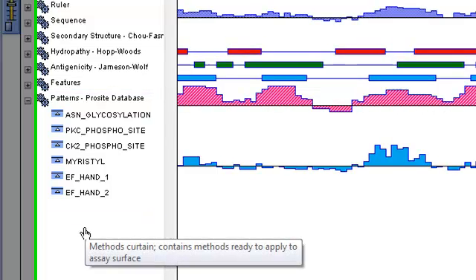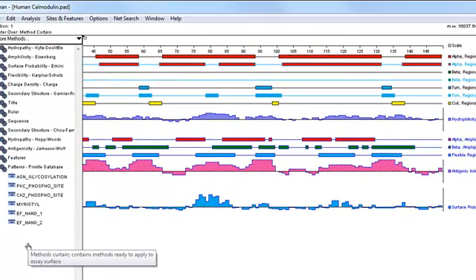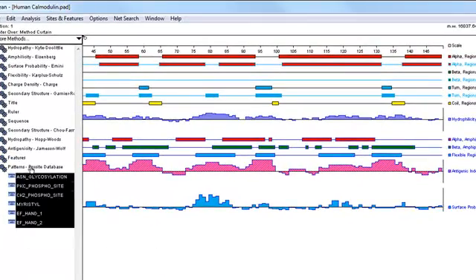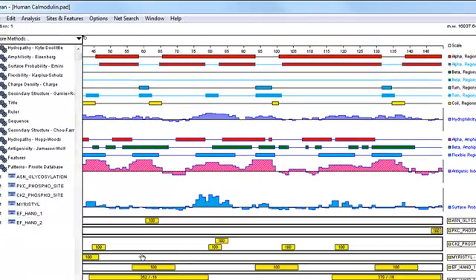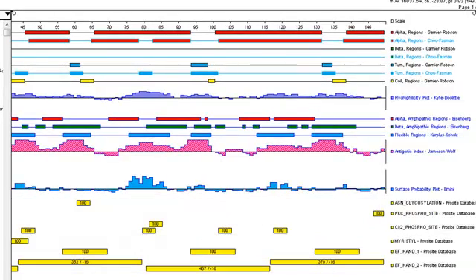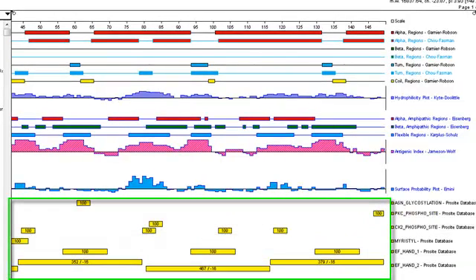This method is applied just like any other method in Protean by dragging and dropping it onto the assay surface. Once it's applied, Protean will search the protein against the PROSITE pattern library and will display any matches it finds as bars on your sequence.